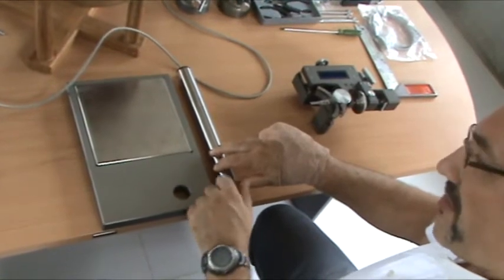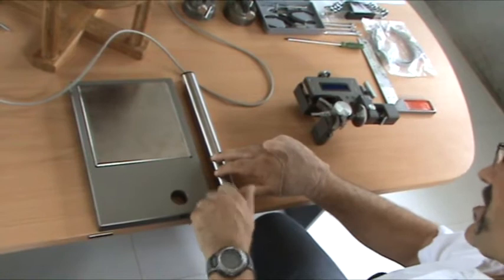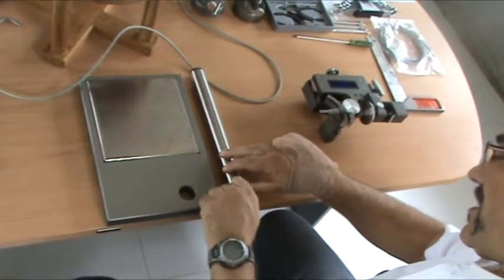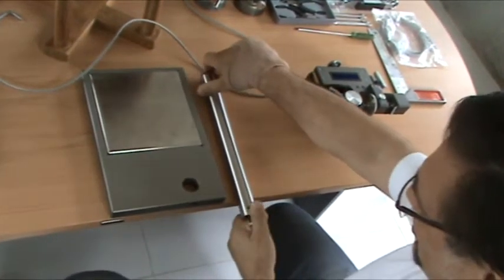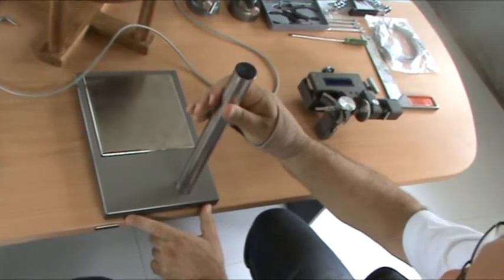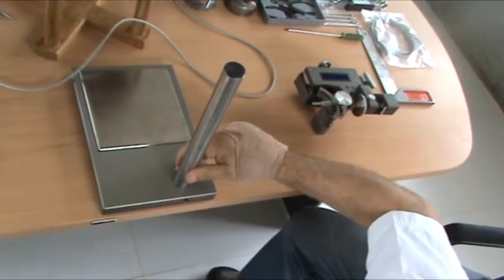Procedure's the same for both instruments. Base, column, unscrew the screw from the column, because if it's delivered via FedEx, it will be delivered in a big box with polystyrene packing, or everything separate. Have to unwrap everything, which will be covered in bubble wrap. Align the holes.